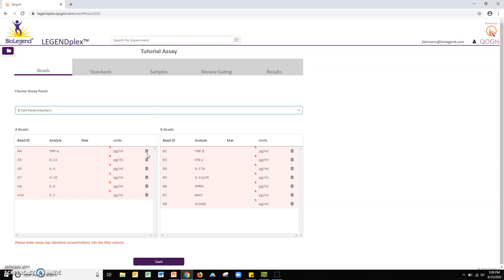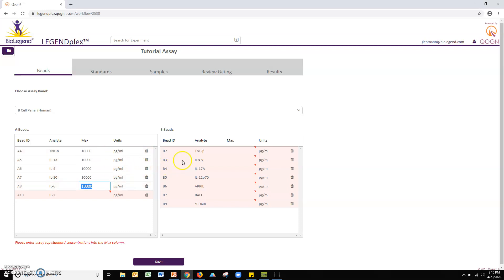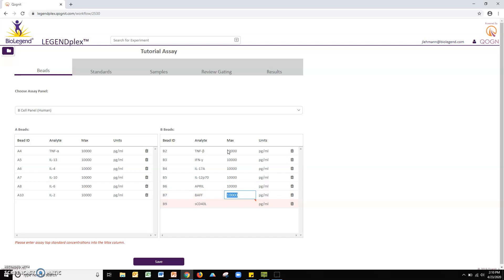Next, enter the top standard concentrations into the max column. These values can be found on the COA included with your LegendPlex assay. Click save to proceed to the data upload steps.